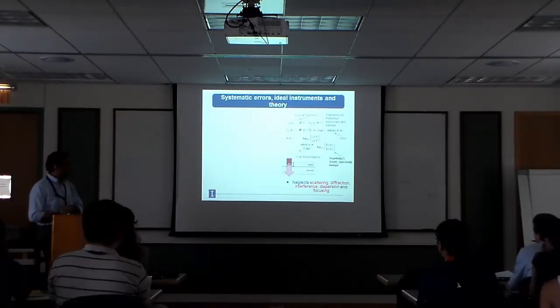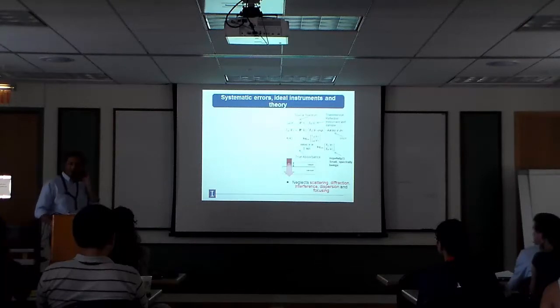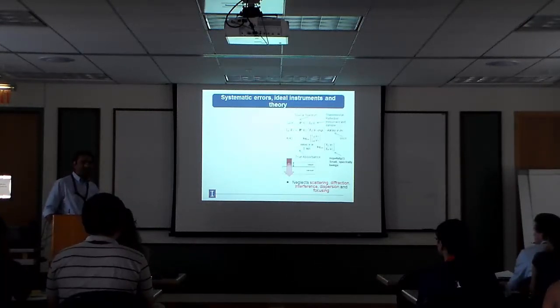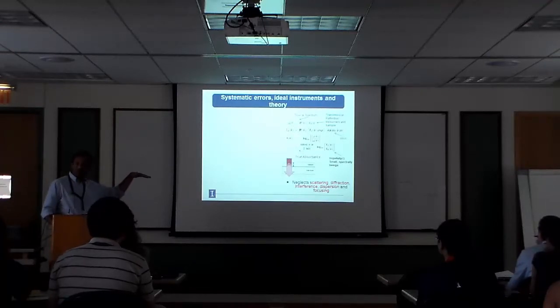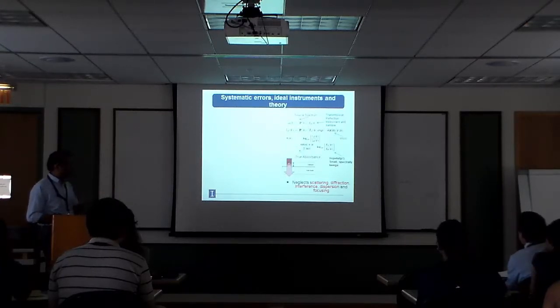And then when we calculate absorbance, it turns out this is Beer's law, just this first term, right? So this is 150 years old, well established, confirmed by everybody, everyone agrees with it. But what we also have is this very small term. And what textbooks don't tell you is that hopefully everyone says this is small, just sort of get rid of it. The transmission functions are equal, so you'll get 1 and this will go down to 0 and so on. But it turns out when you do microscopy, this term is not really small because you have scattering, you have diffraction, interference, you have all kinds of effects.